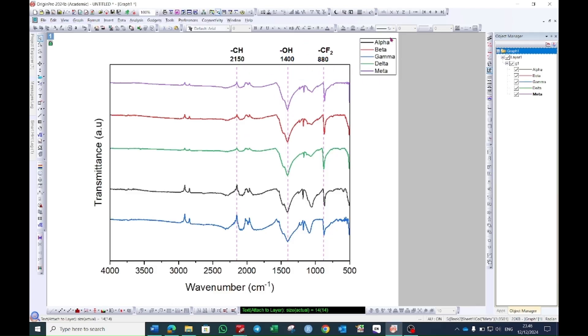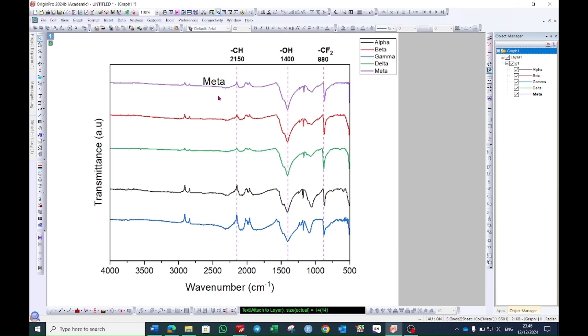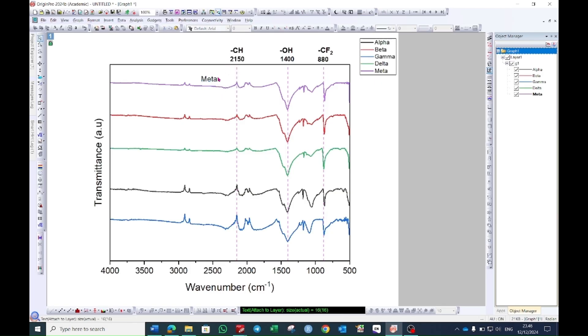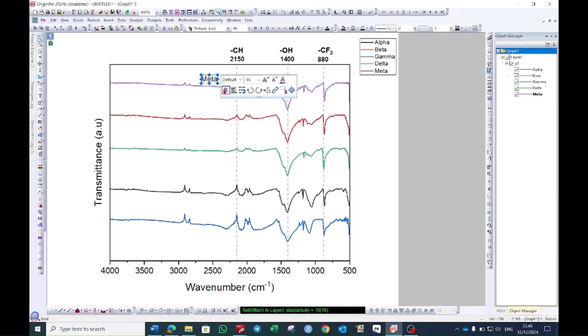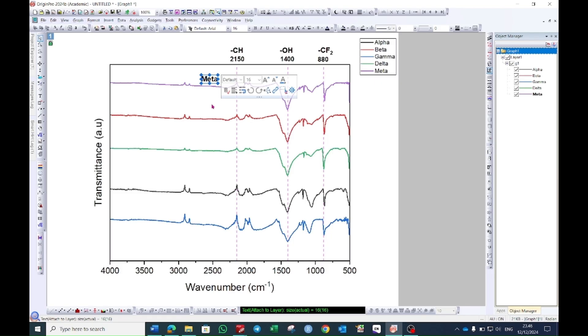Suppose you don't want this legend but you want the names here. You can select this text box again and click on this line and then you can give the name and you can change the size again. Suppose you are okay with this one. You can also make it bold. Suppose you are okay with this one then you can select this one and press ctrl c and ctrl v and bring it down.